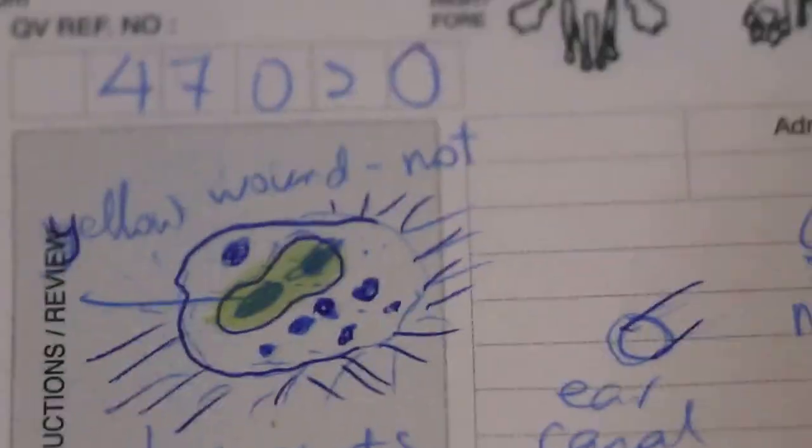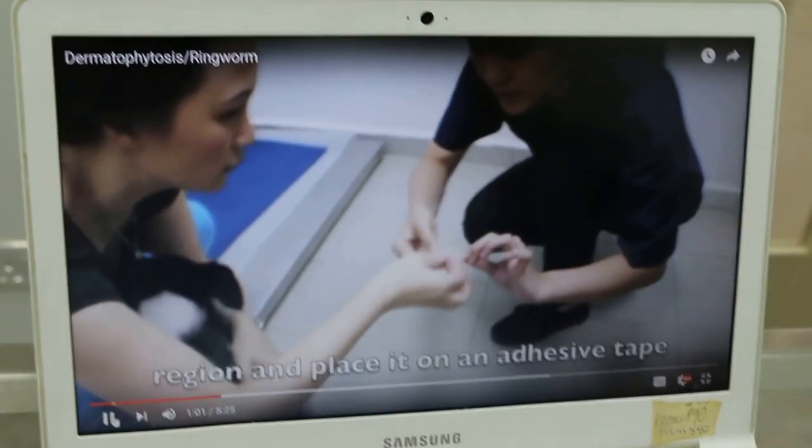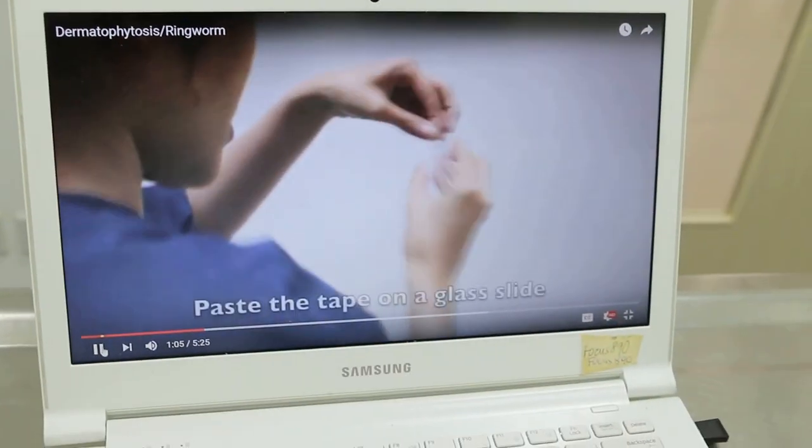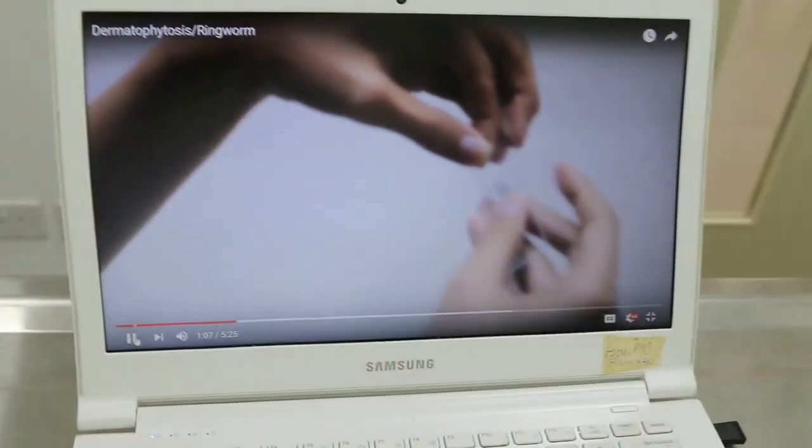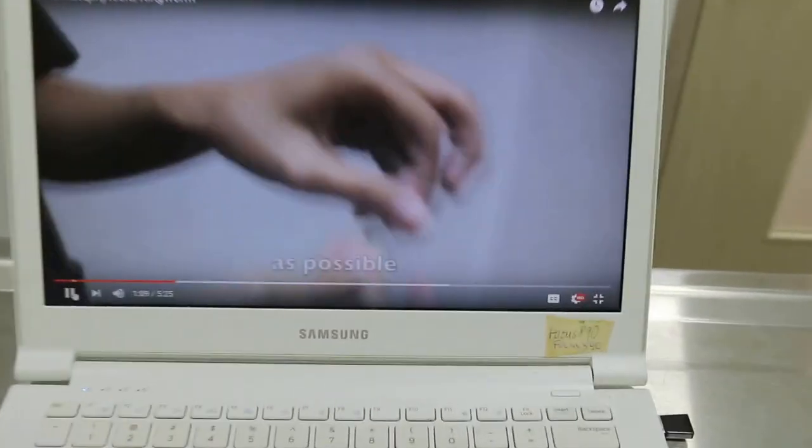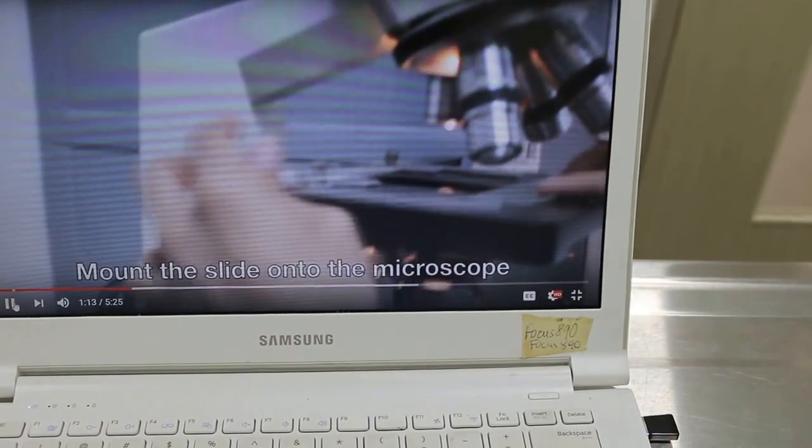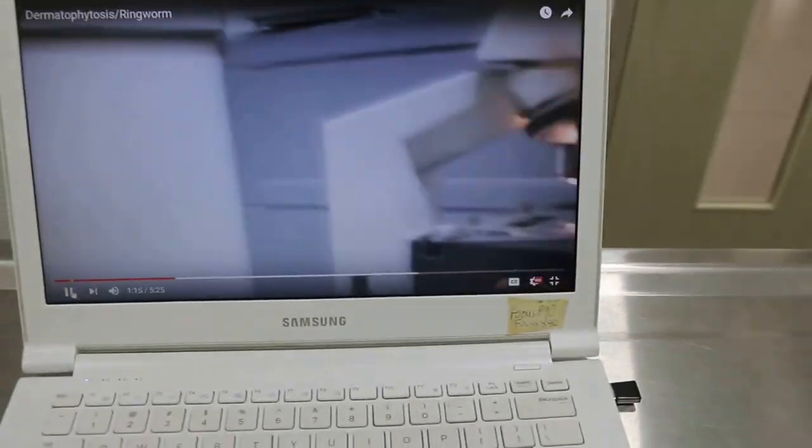So what we do is we have to make sure that there is no ringworm. So we will do the microscopic technique to check for the ringworm. This video shows: place it on adhesive tape without touching it, place the tape on the glass slide, definitely remove as much air bubbles as possible. Then mount the slide onto the microscope.